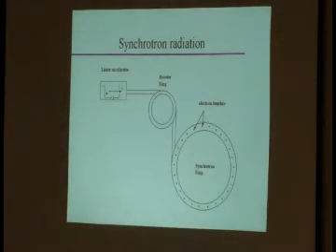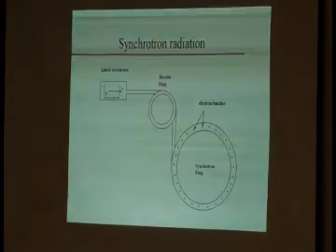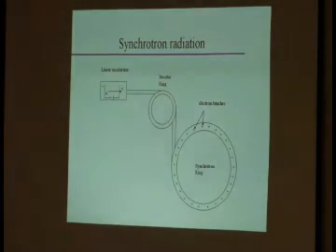That is the place where sometimes people get suspicious and say, okay, they circulate there. Why on earth would an electron in its right mind circulate? Any ideas? You've got to use some kind of magnets to make sure that the electron stays on its circular path. Exactly.